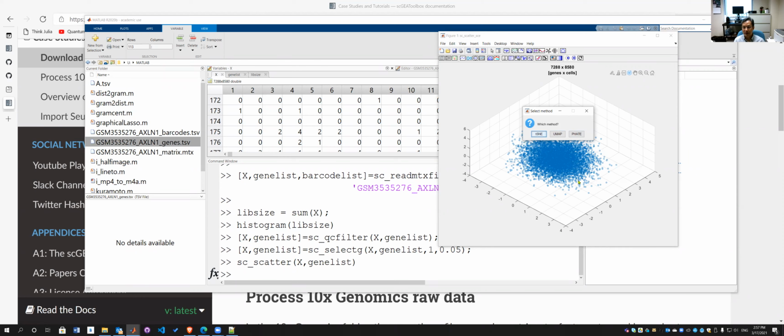Okay. So I will leave it here and we come back in part 3 to continue. Okay. So I'm going to click this to allow the algorithm to run in the backend, and we will come back. All right, any questions before we take a break?